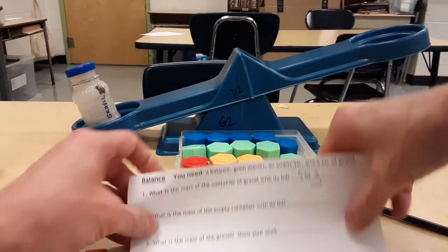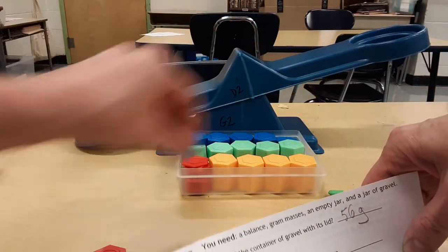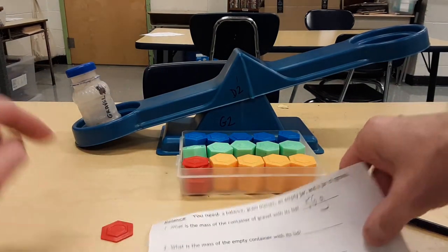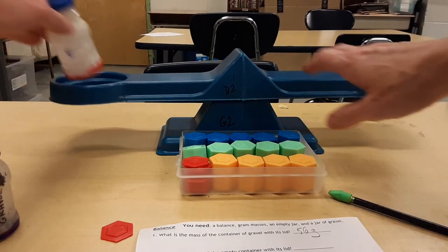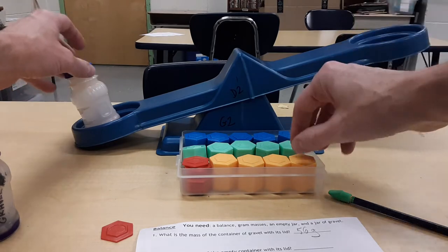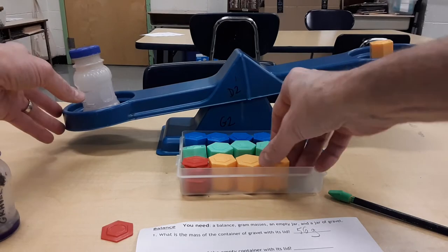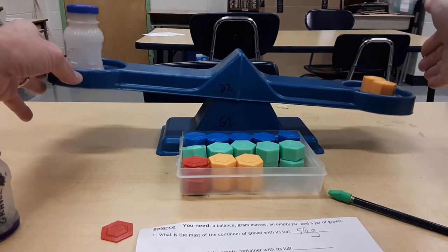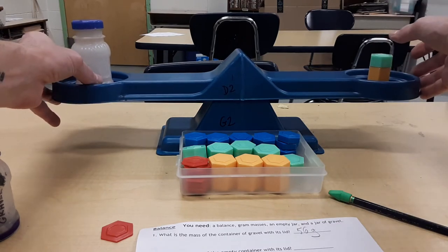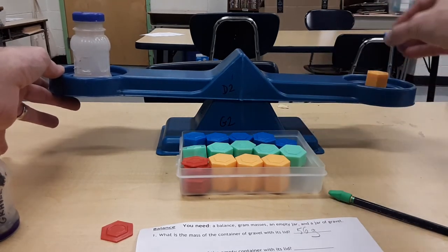Okay. Step 2. These go back so I know where they are. Remember, this has to be neat when you're finished. What is the mass of the empty container with its lid? Do the same process with the red one. Remember, it's not going to stay in the middle now, so don't try to make it. It's just going to drive you nuts. Always start with yellow. Nope. Try another yellow. Put them straight line. Too much. Get rid of it. Do a green. Green is too much. Try a blue one, the 5.